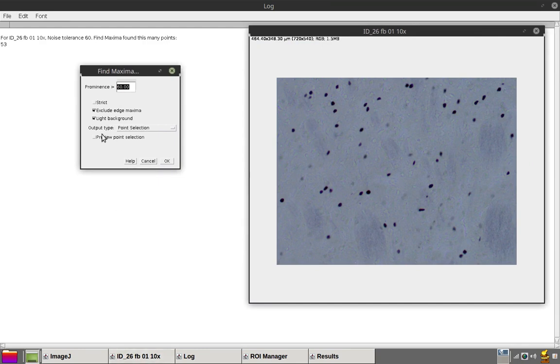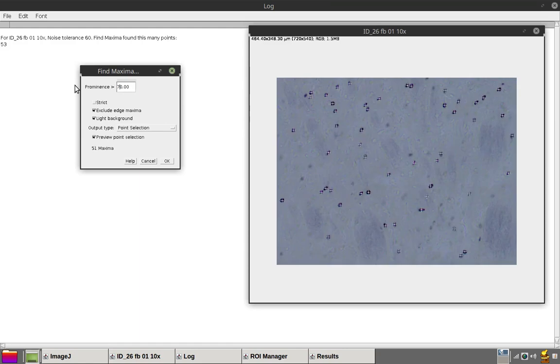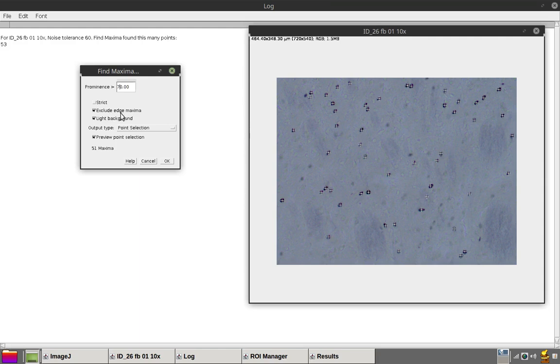It's easier to add points than to remove them. Setting a slightly higher prominence value is a good idea. And also, make sure that the exclude edge maxima value or setting is checked off.